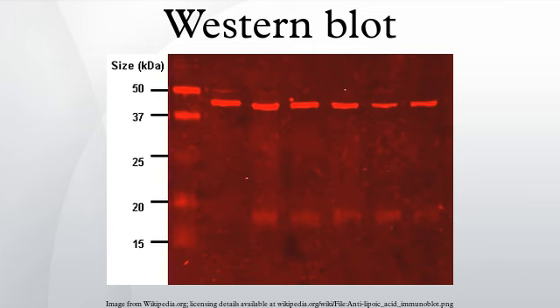Detection: during the detection process the membrane is probed for the protein of interest with a modified antibody which is linked to a reporter enzyme. When exposed to an appropriate substrate this enzyme drives a colorimetric reaction and produces a color. For a variety of reasons, this traditionally takes place in a two-step process, although there are now one-step detection methods available for certain applications. Two steps: primary antibody.